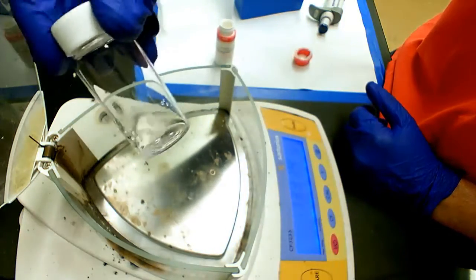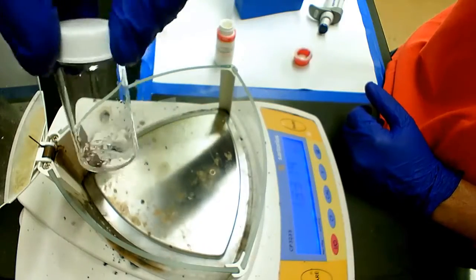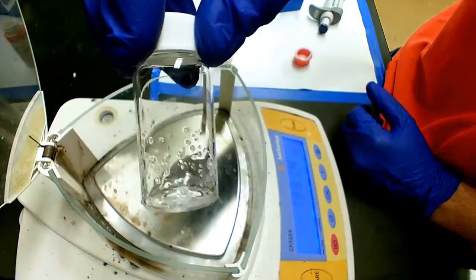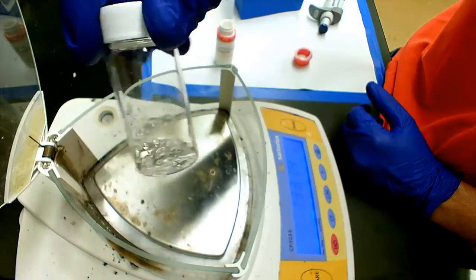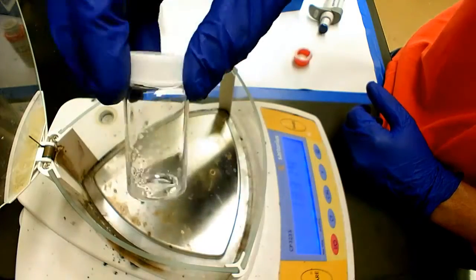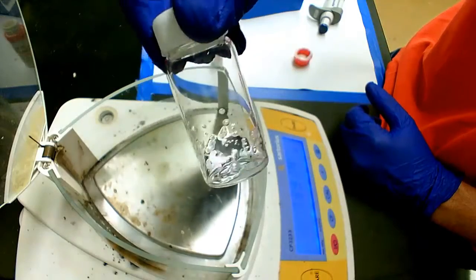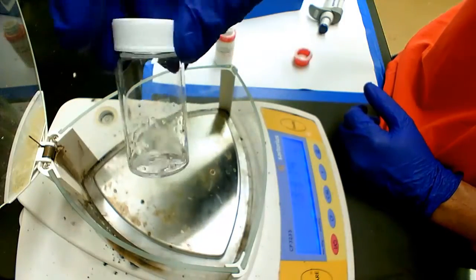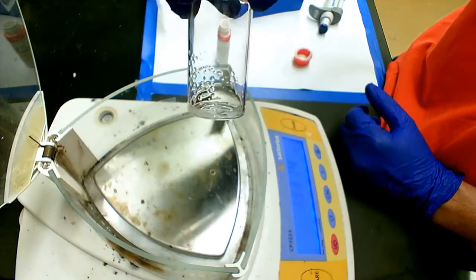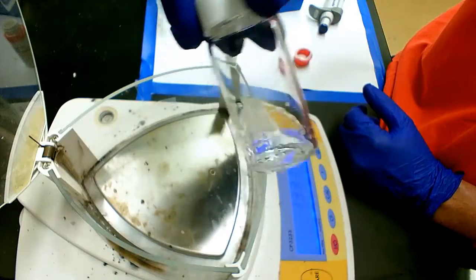Just for this demonstration, I only added a small amount for you to see. Now your mission is to fully dissolve the polymer. Right now you see the polymer is not fully dissolved. To dissolve PEO, depending on the molecular weight, it will take a few hours up to days until it is fully dissolved. So I would recommend you prepare your stock solution way before you want to make your sample.